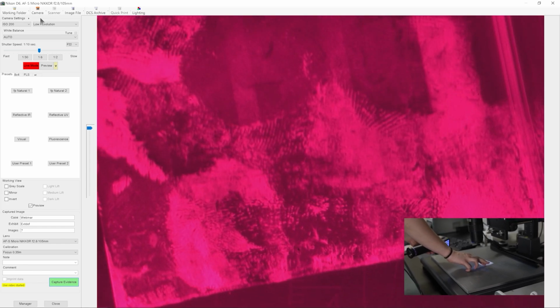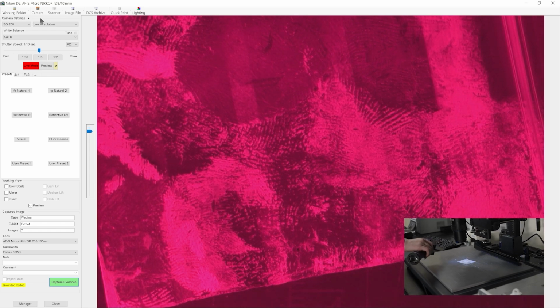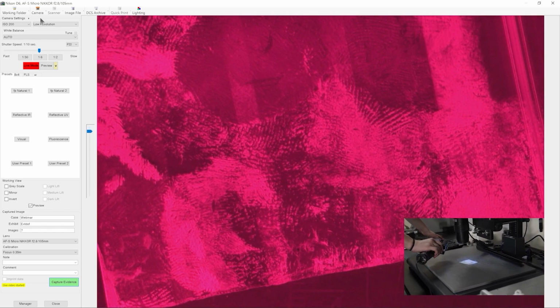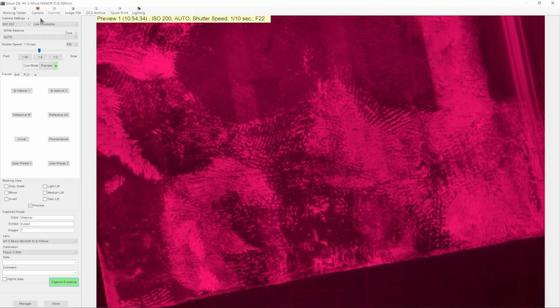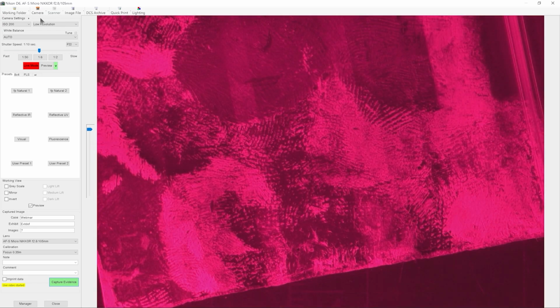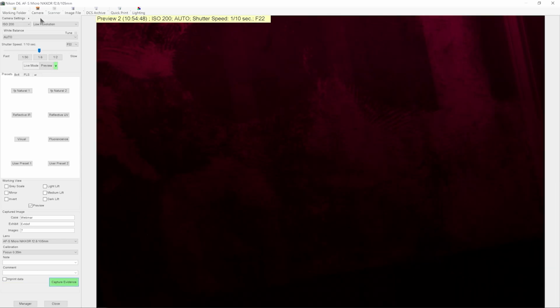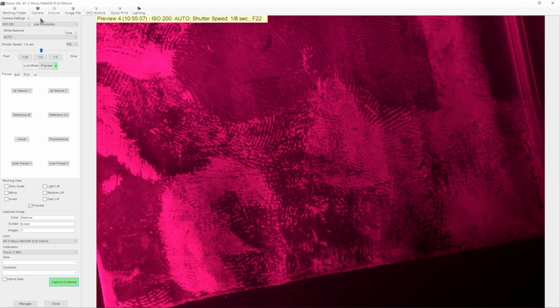So visibly, all we see is quite bright UV fluorescence from the surface. However, when I capture a preview, we can now quite easily see the ridge detail on this surface. What's happening is that the cyanoacrylate is actually scattering quite a lot of the UV light. So a lot of those ridges are appearing lighter than the background. The background is absorbing the UV light.